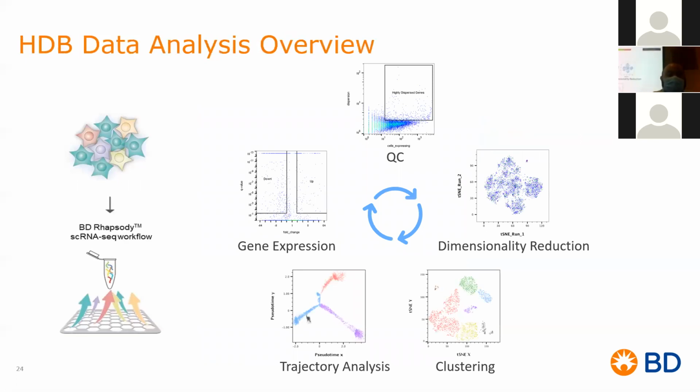Again, as you saw, I showed you that you could start at any of these steps and go back and forth. I could have gone into QC like I showed you, a linear progression. But once I got to a cluster, I could go backwards again and evaluate the QC of that cluster and then start that circle again. With a multiomics experiment, the other beautiful thing is you could spend hours and hours and days on it and get several publications out of it because the data is so rich, provided that the experiment was well planned out and the QC is done well.